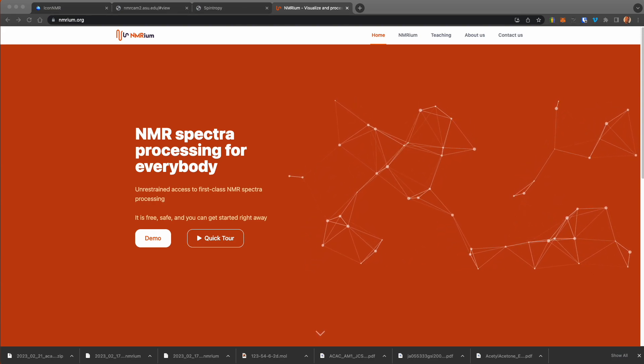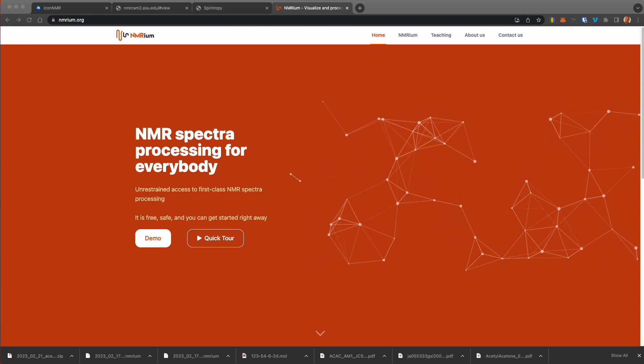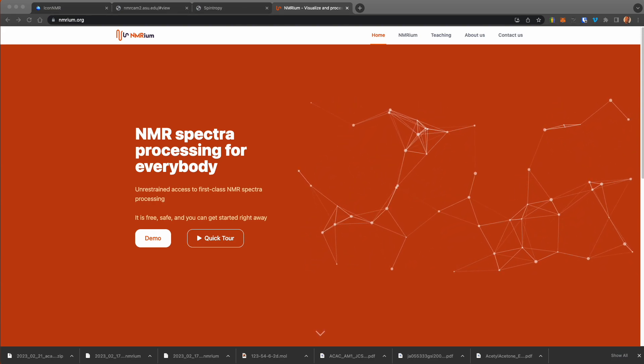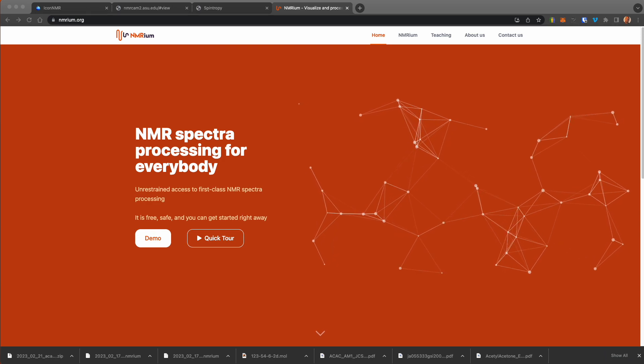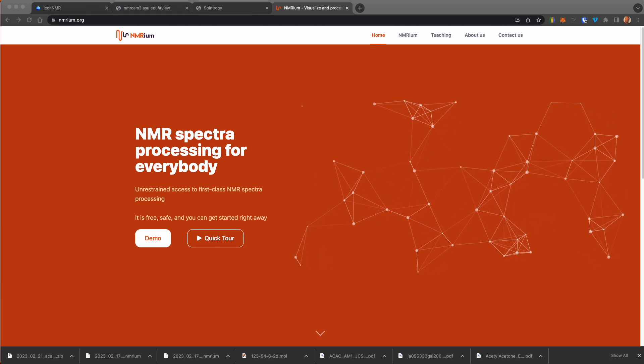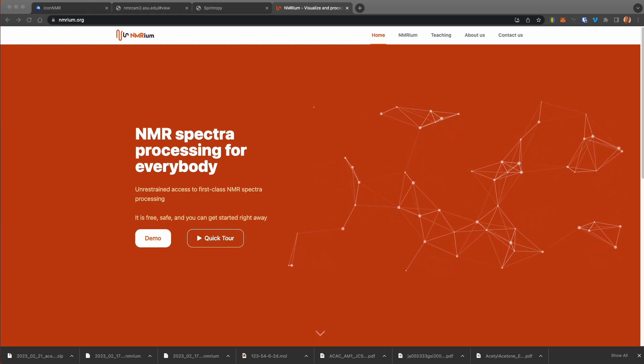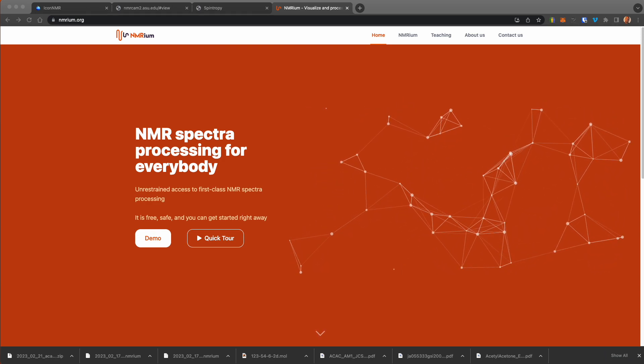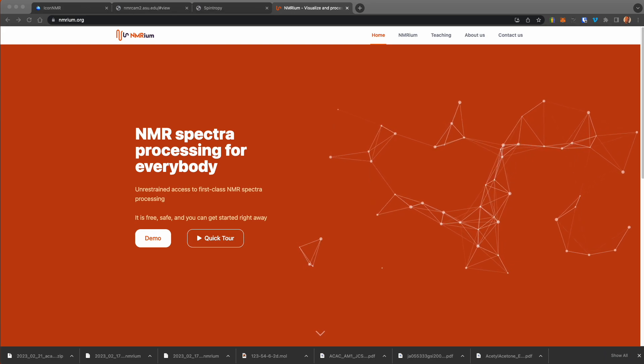NMRium allows for fast, easy, and convenient processing and analysis of NMR data within a modern web browser.